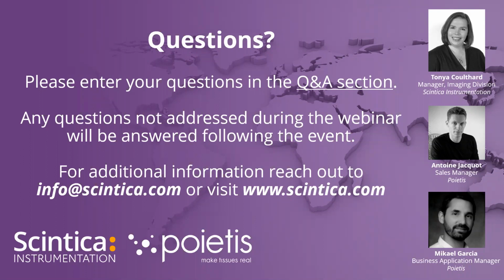So traditionally, the terms bioink and ribbons have really been used for more extrusion-based bioprinting systems. With laser-assisted bioprinting, as Antoine and Mikhail showed in this webinar and in our previous webinar, the cells are really just contained in the cell media alone. And so there's no need for other extracellular matrix compounds or materials to be incorporated for the fabrication process, or for the printing process with the laser-assisted bioprinting. You would print those onto your matrix using the extrusion and the inkjet heads. So when the cells are being prepared, they're typically prepared in the cell media alone and printed with the specific patterns using that laser head of the NGb-R system.